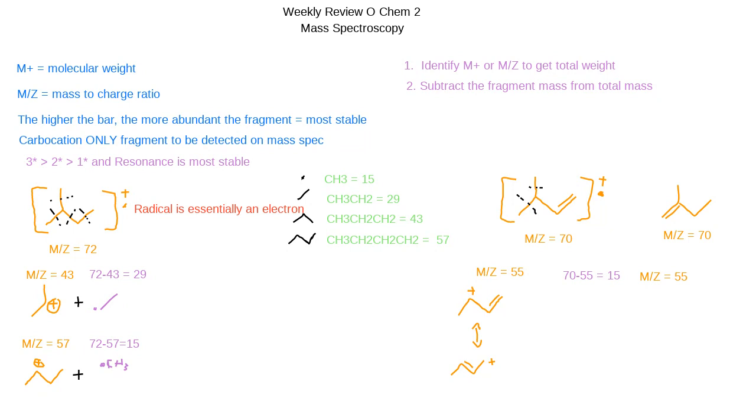I don't need to do the math again because I already know it's going to be 15. So let's draw our potential lines. We could cleave right here, or we could cleave right here. This time we actually have 2 options. Last time we had 2 options too, but really it was just 1 because they were not unique.